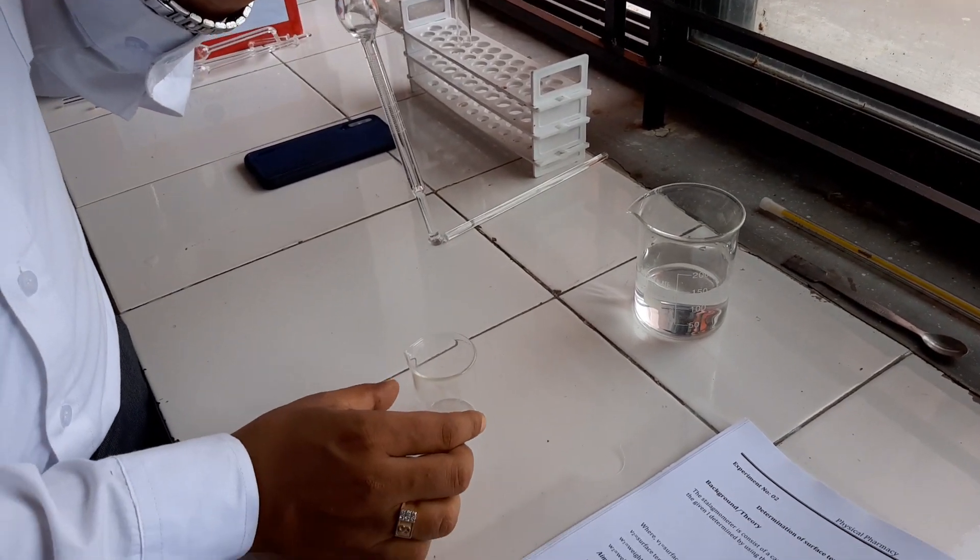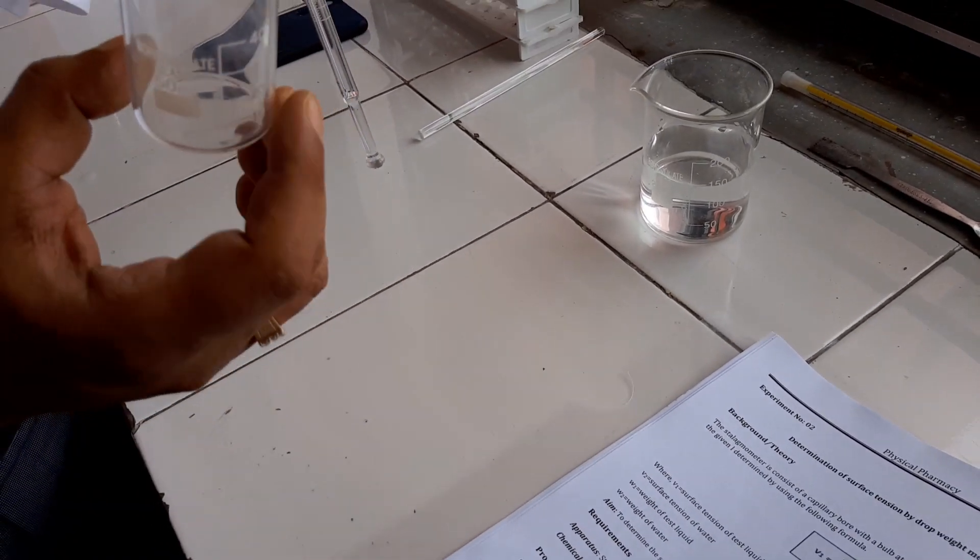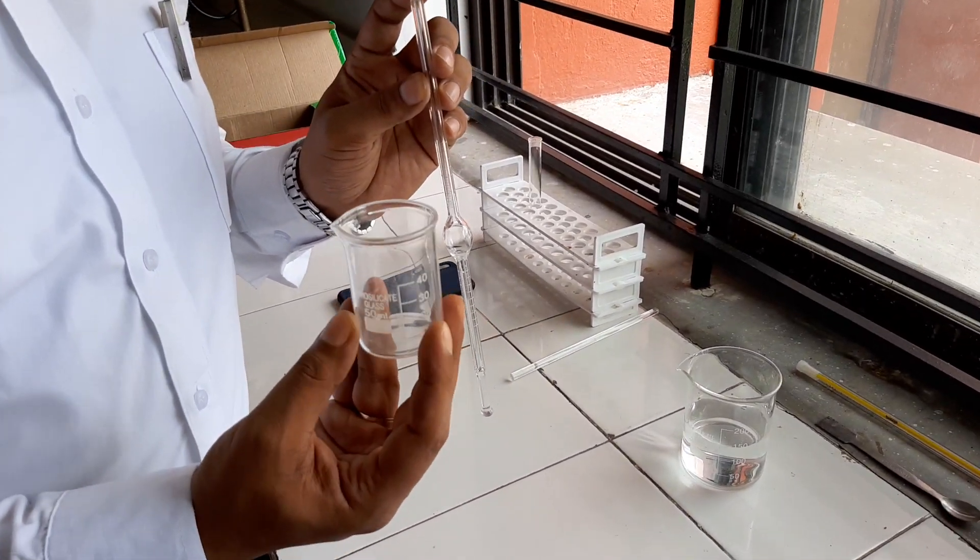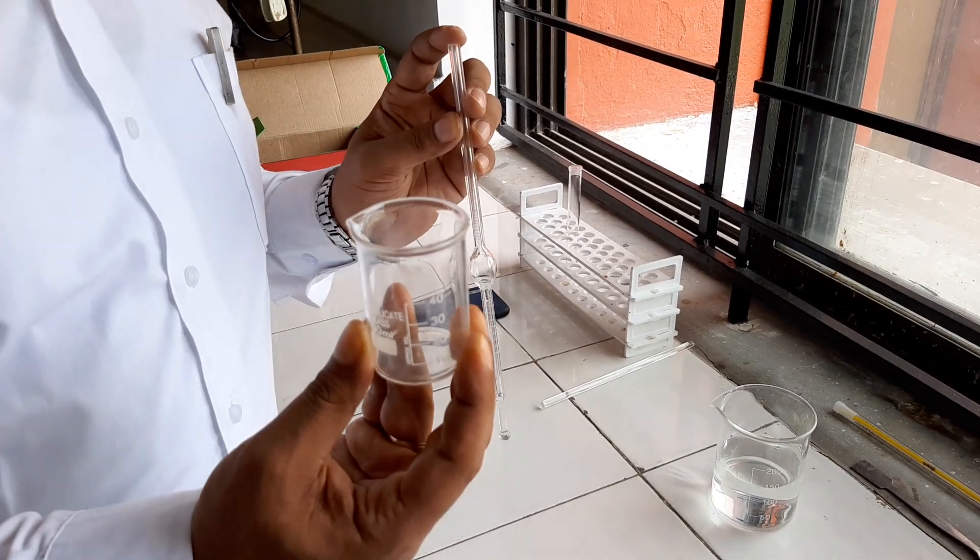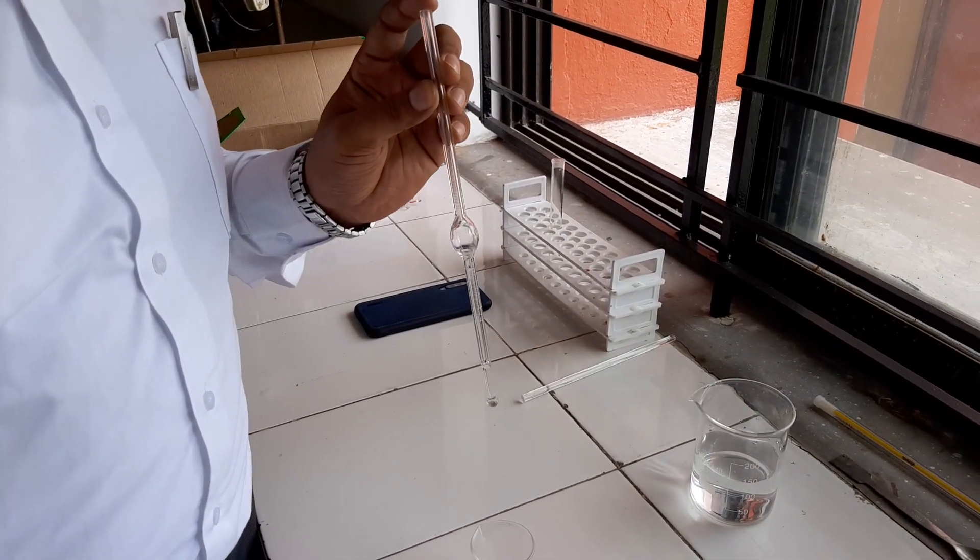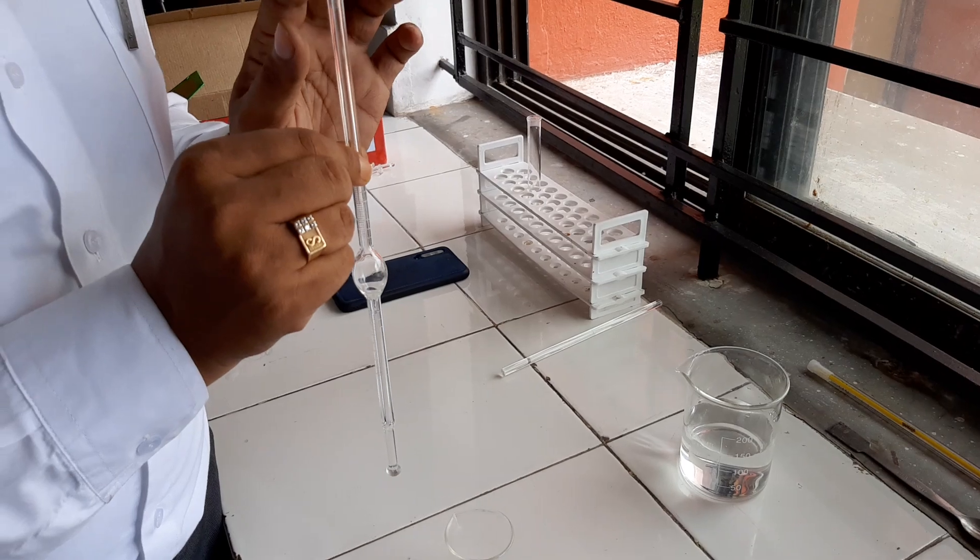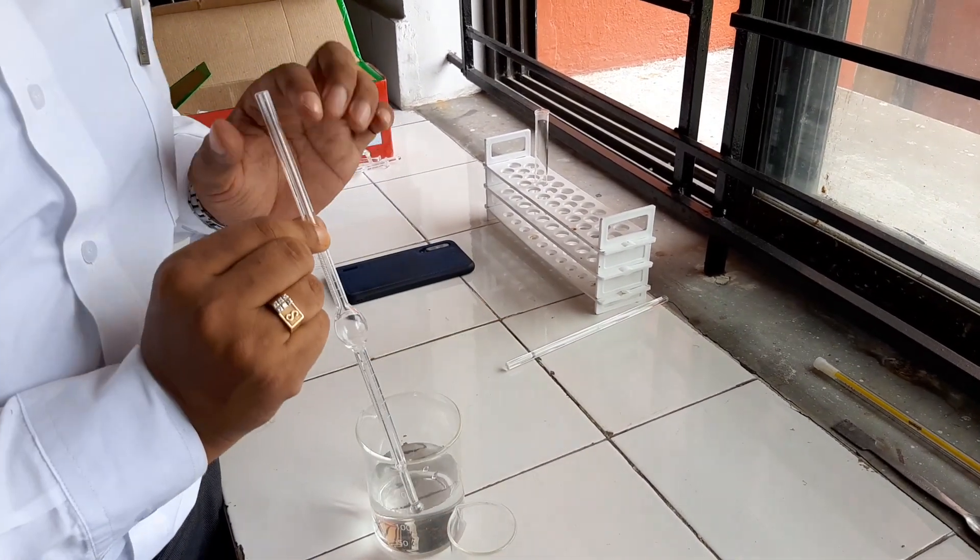For that, you have to take first one empty beaker and you have to take the empty weight of this beaker. For example, that is W1. Then, you have to suck the liquid from here up to this mark, the upper mark.